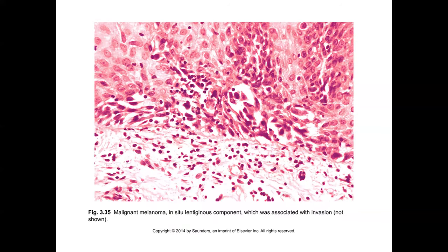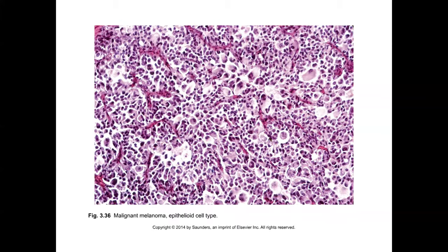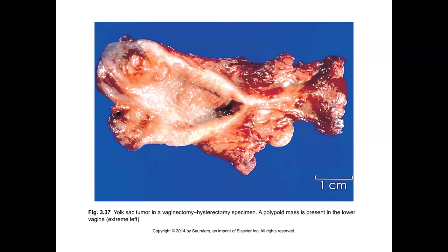Melanoma can also occur in the vagina, with many of the typical morphologic features helpful in recognition as elsewhere. An example of a more epithelioid type shows nested cells that are not very cohesive, with somewhat eccentrically placed nuclei and possibly cherry-red nucleoli.